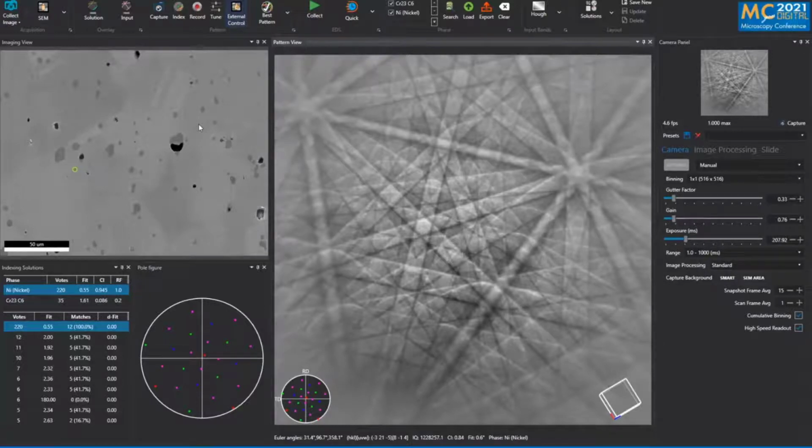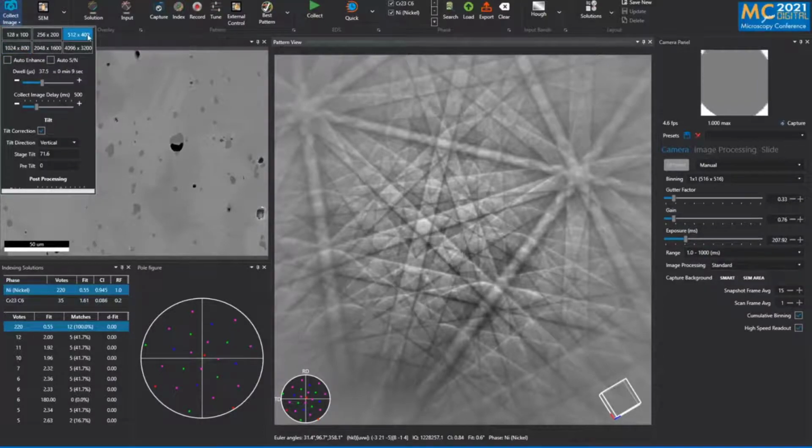This is with a relatively high current of 1.5 nanoamp, 1 to 1.5, something like that. If I want to reduce that, I'm going to, let's say, 100 picoamp. So yeah, just a moment to set up my SEM image again, so we are sure that we have a nice picture.